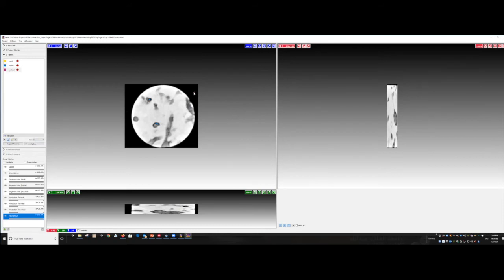And I wanted to know that this is the outside, this is the outer layer. Just a quick test. All right, now if I hit on live update, it will automatically detect those labels. I'm just going to give it some time because you can see here it changed right away. I'm going to zoom in.